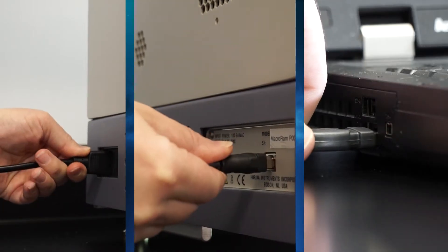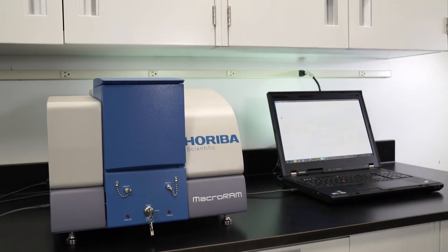Plug in the power and the USB. Launch LabSpec 6 and you're ready to go.